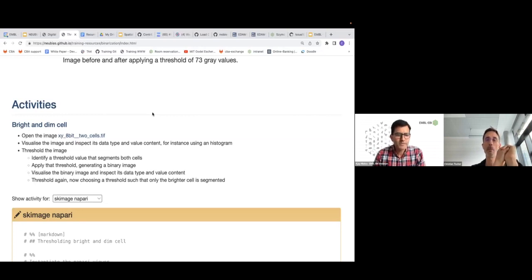Yeah, that's very good. I think there are very powerful flow cytometers as well these days, where while they are sorting, they're also taking images and they sort cells according to those images. So I think those can also be used. I agree. Exactly. I forgot this. Yes, this is another one.